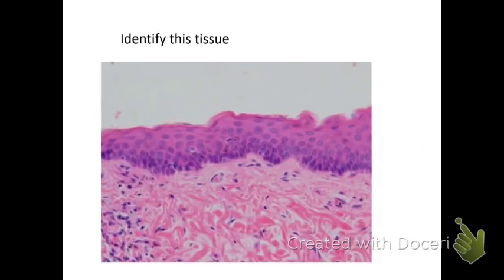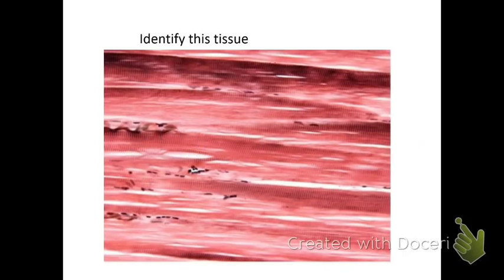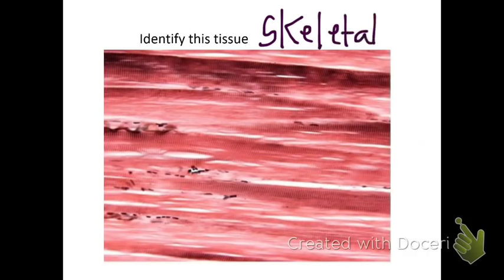When you look at this, you can actually see the striations — you can see all the striations. So this one is skeletal muscle.